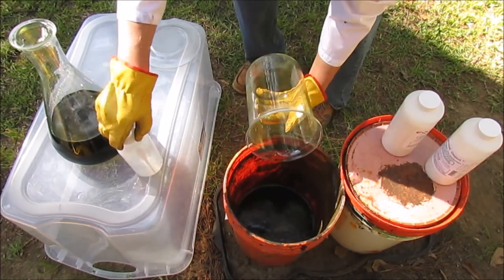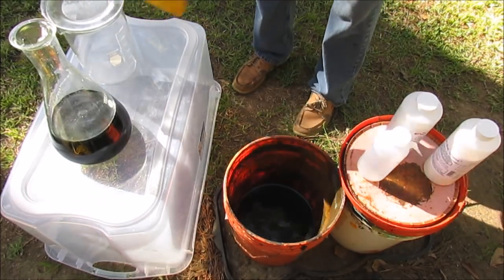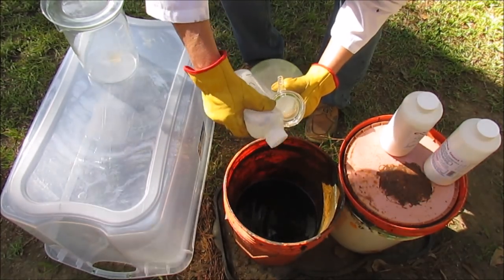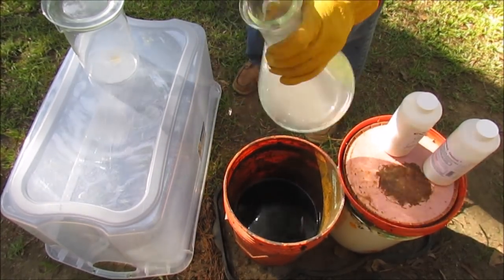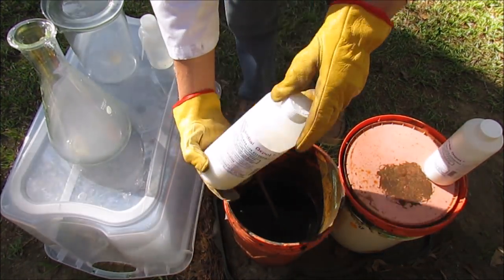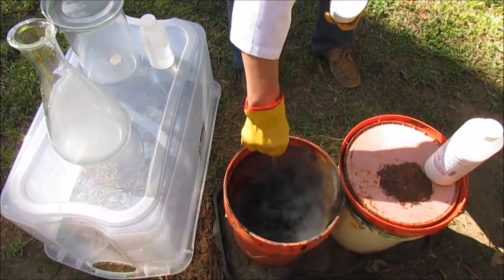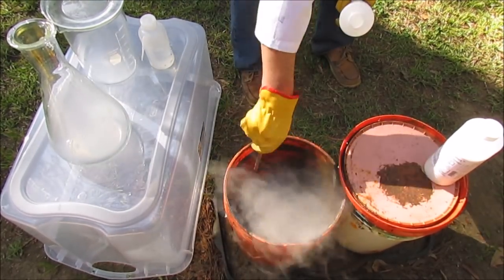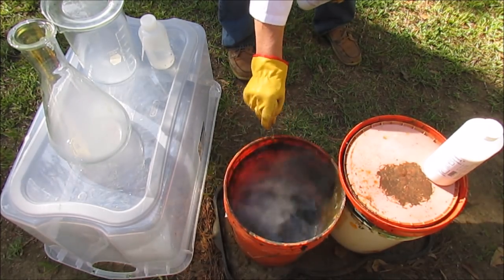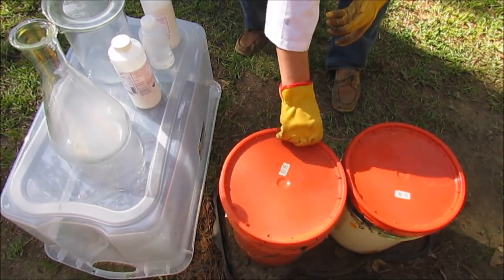Tested both of these solutions with stannous chloride. There's no gold in solution in either one of these. They're just straight waste. And so what I'm doing here is pouring it into my waste buckets that are located outside. And what I'm going to do is treat this waste with some sodium hydroxide, lye. That's sodium hydroxide. And I just add it to the acidic solution until the solution becomes neutralized. And then all the metallic solids will precipitate out as metal hydroxides. And then I'll filter those out and I'll process the waste the rest of the way for disposal.